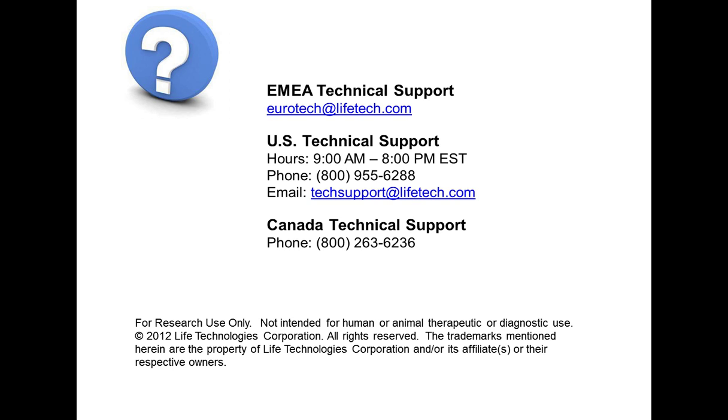So there's a question about how different flow cytometers differ. There are a lot of different cytometers available on the market from many different vendors. They differ in the selection of their lasers, the color of the lasers, and the number of lasers, and then within that, how many detectors there are. Of course, each company has their own unique features that they promote within those different cytometers. Some of them will offer things like absolute counts, if it's syringe-driven, or acoustic focusing. So there's a variety of different things that different flow cytometers offer.